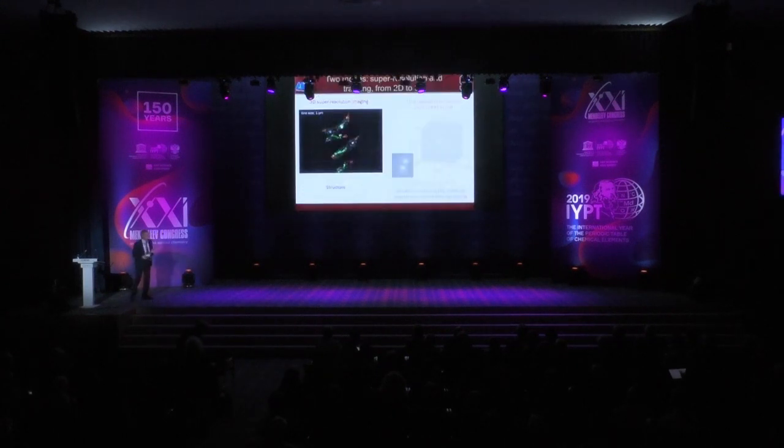So now, the last thing that I want to point out and just remind everyone so no one's confused, I've been talking partly about imaging of single molecules to produce a three-dimensional super-resolution image. That's an extended structure, and it needs to not be changing while we're measuring it. We want to measure that extended structure, and I've shown you many examples on the left, turning that diffraction limited into this rotating image, which is not rotating.